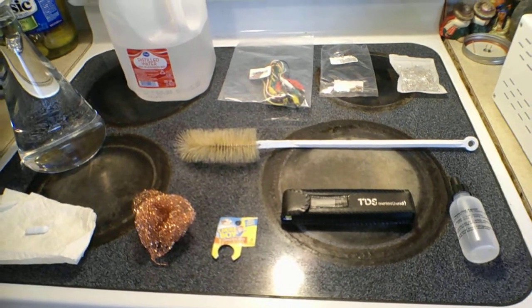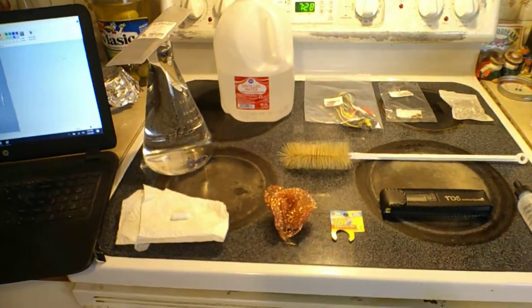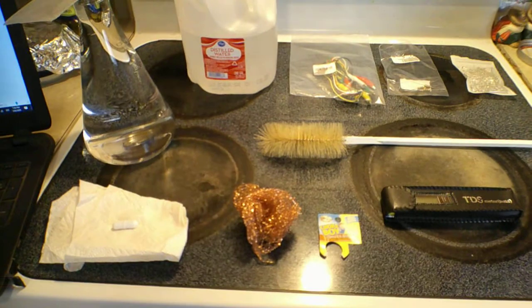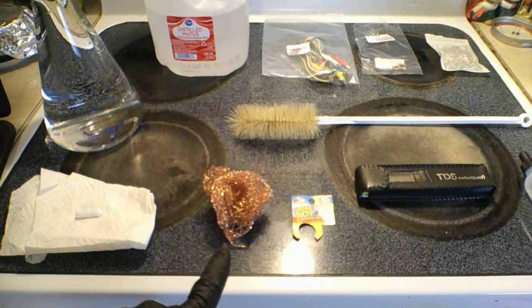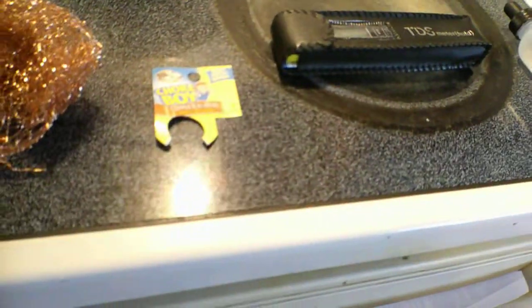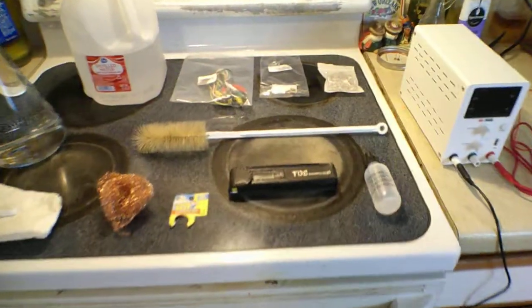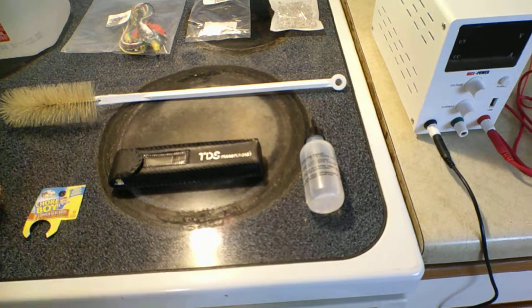This is the bottle brush — indispensable when you're trying to clean these Erlenmeyer flasks. Your silver rods, if you want to make colloidal silver at home, should only be cleaned with a pure copper scrubby. Today we're using a Chore Boy.